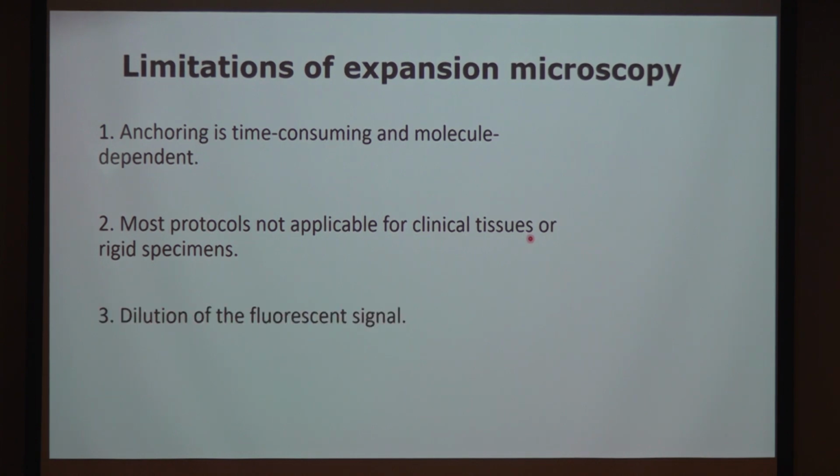And then the third limitation is that because you're expanding the sample, fluorescent signals that used to be very close to each other are now very spread out. And that can affect how you can detect the sample or detect the signal or not.